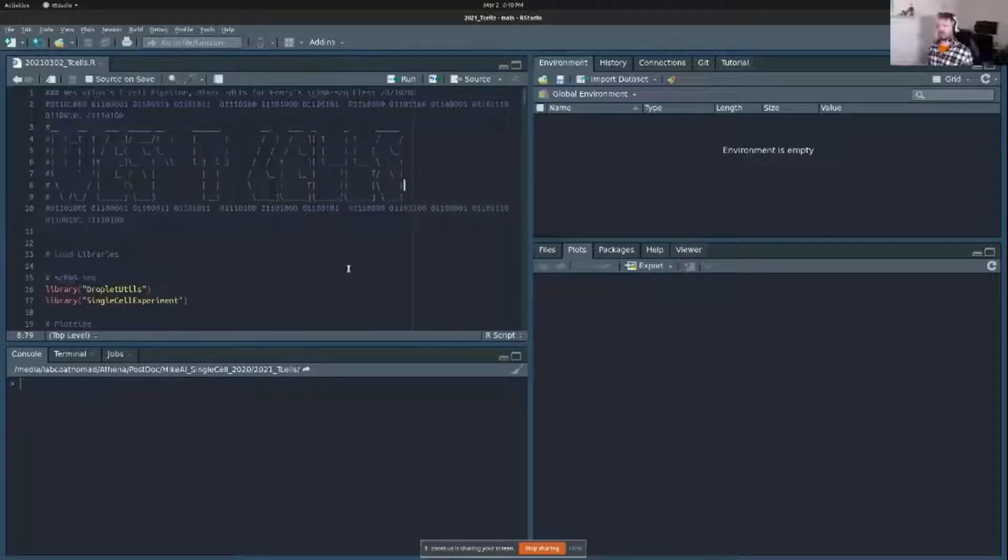Yeah. You're not going to be able to run everything, guys, because I'm not using a public data set. I'm using my own data set because I want to show you what dirty, raw, real data looks like and why some of the tutorials you follow online are great when your data is pretty and pre-processed, but not so much in real life when you're in the lab and maybe your cells are sitting on ice a little bit longer and you get more cell death than maybe the experiment online does or so forth.